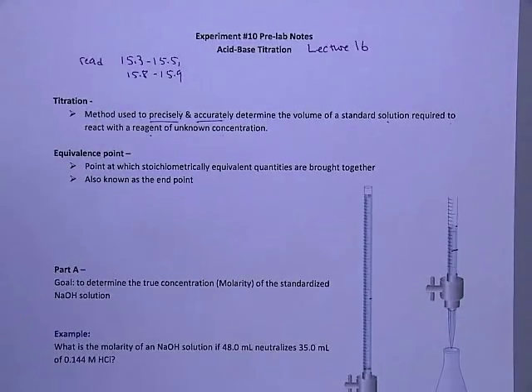Now you'll see in this week's lab, in part A, we're trying to determine the concentration of the standard solution, whereas in part B, we're actually determining the concentration of an unknown reagent solution. And I'll explain what I mean by that when we cover each part in depth.